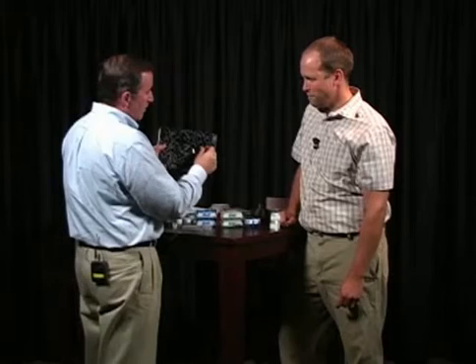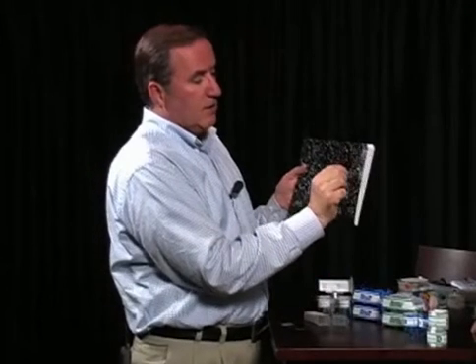If you just bend that tape like that and just touch it to any surface, you're not going to pull off the wallboard, the wallpaper, anything that you don't want to see. And mold is a surface growth phenomenon. We're not digging into bread to get that sample. This is a surface sampling. That's correct. Mold is mostly a surface phenomenon. It's not a building material, so what you're going to want to see is what's on the surface. And they stick up from the surface. Some of them are slimy and they're harder to get, but you don't need to burnish it down. Remember, just a little bit is a lot.